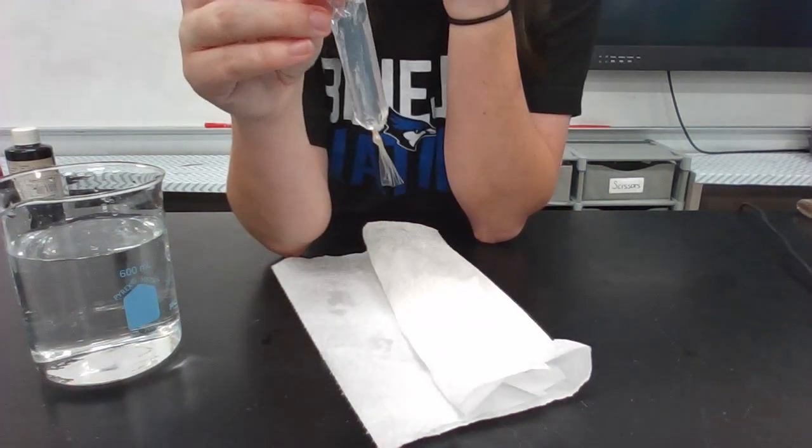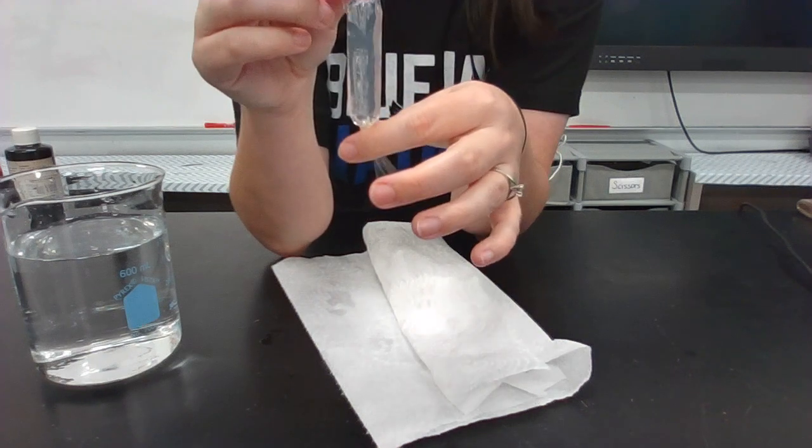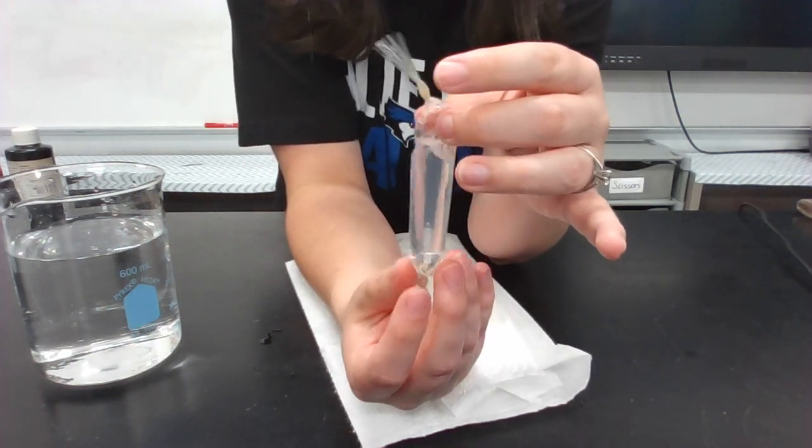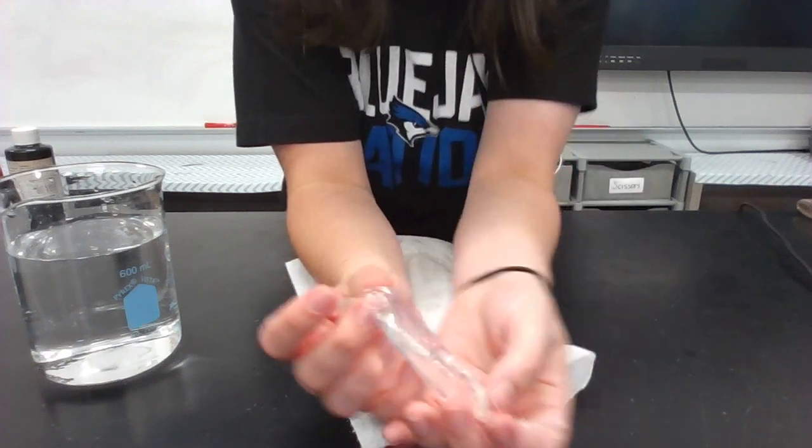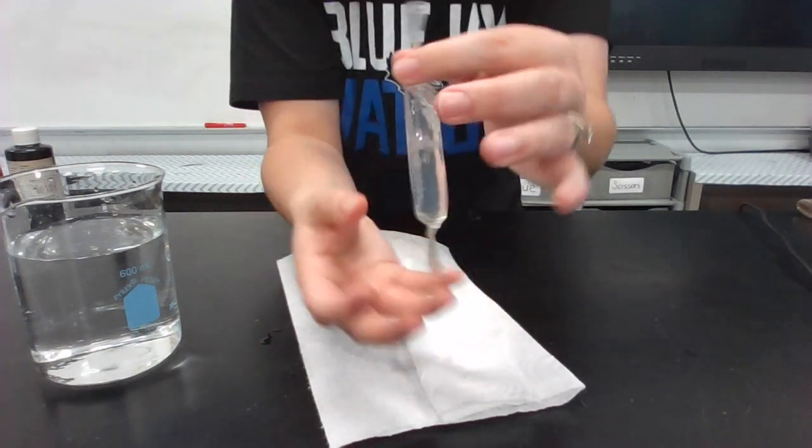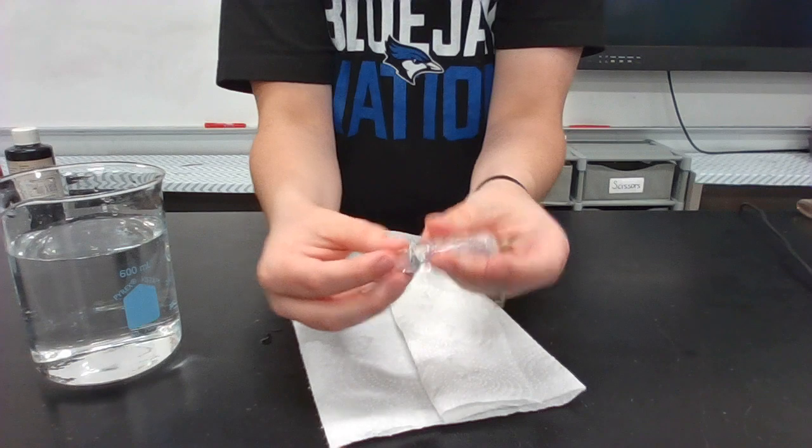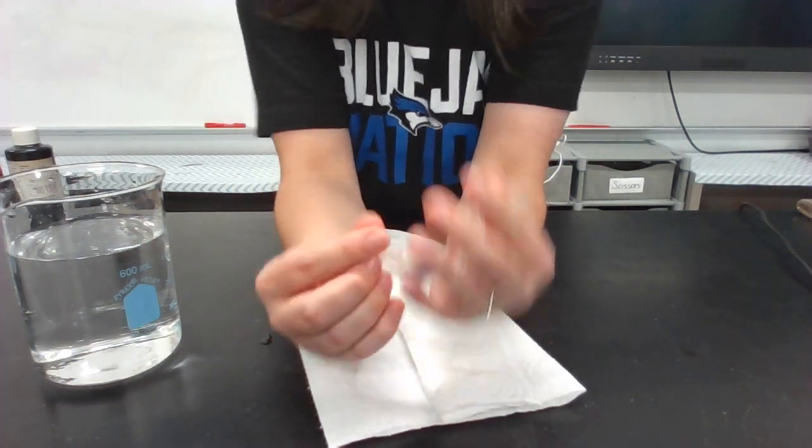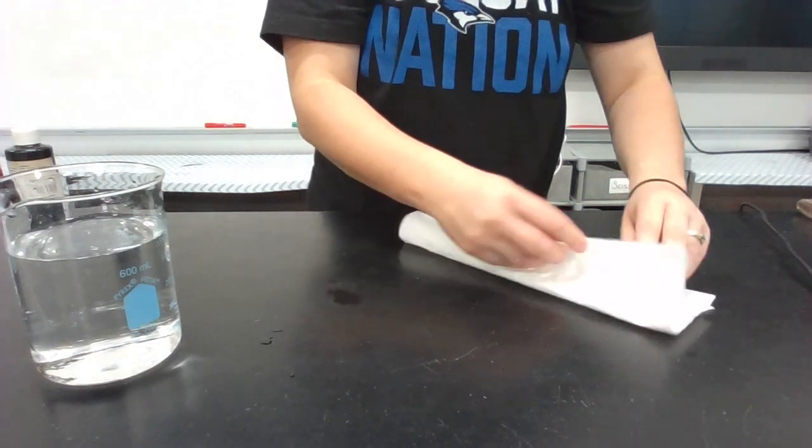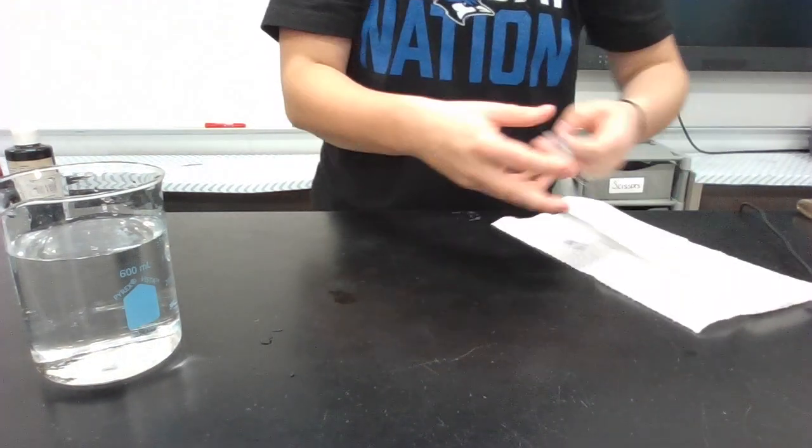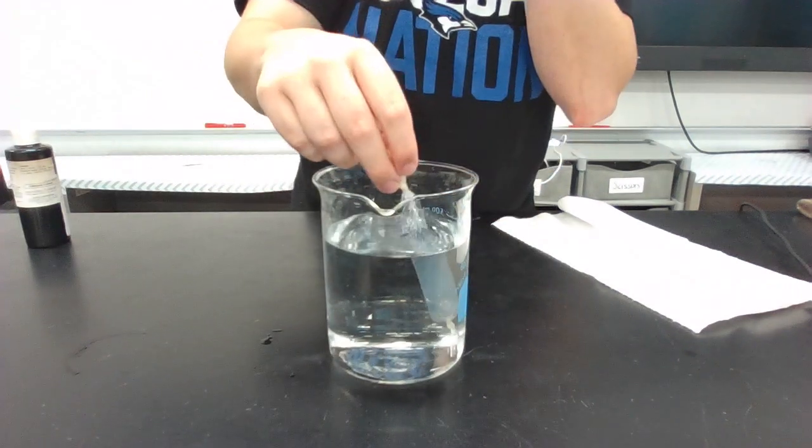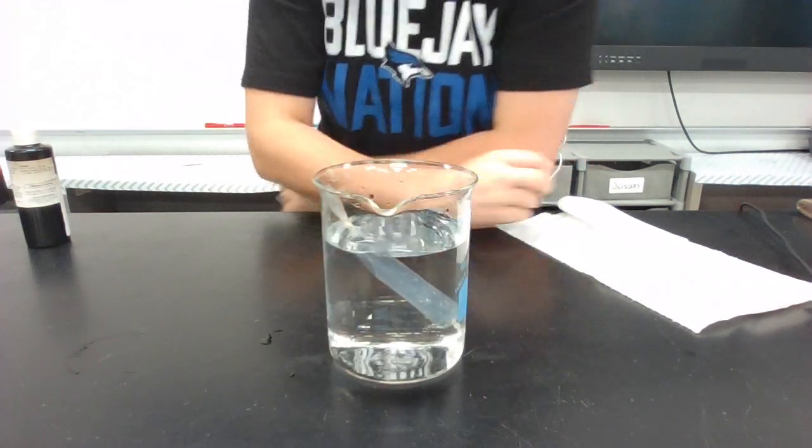So the pores that are in this tubing are so small that the stuff that makes up this starch solution, it's not going to leak. We can see that because we can shake it. We can even squeeze on it. The stuff inside is not going to come out. So now that it's all dried off, triple check, I'm going to take this and I'm just going to put it into my beaker of water and just let it float around there.